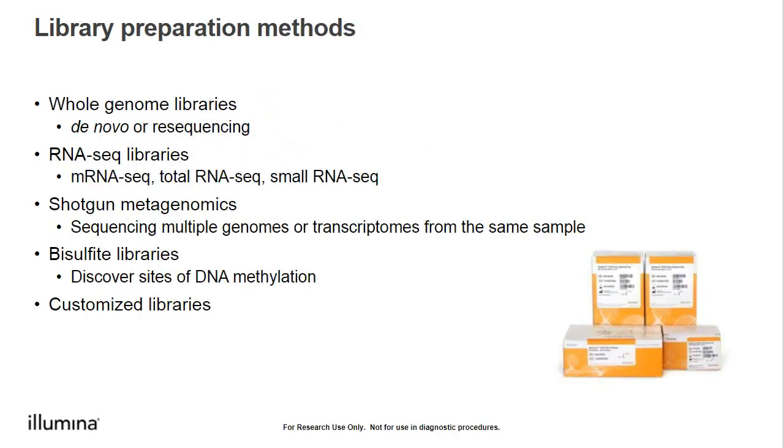There are different library preparation options depending on our project goals. Libraries can be prepared from genomic DNA for resequencing applications, as well as for sequencing a genome that has never been sequenced before, de novo sequencing.